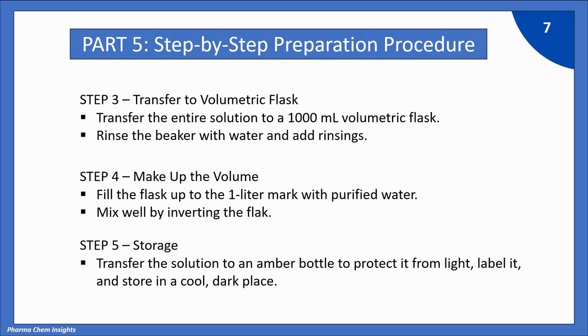Step 5, storage. Transfer the solution to an amber colored bottle to protect it from light. Label it and store in a cool dark place.